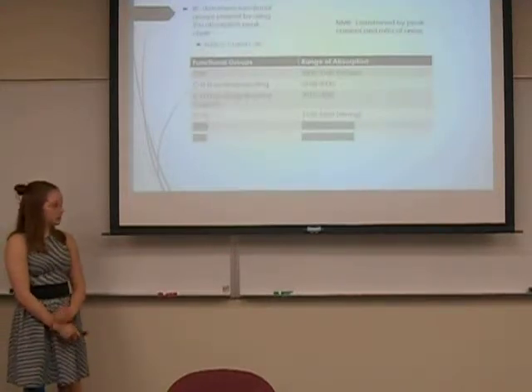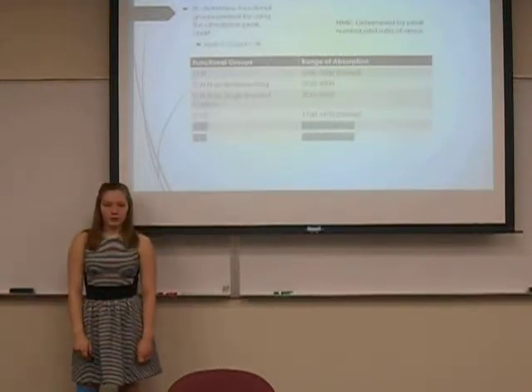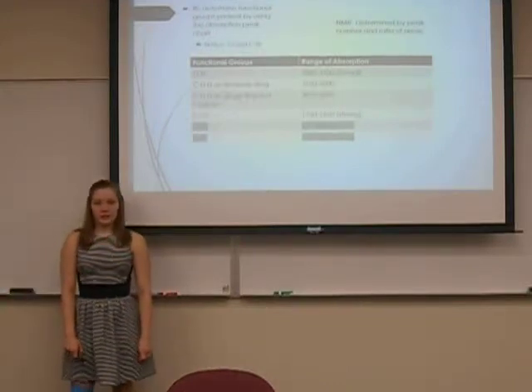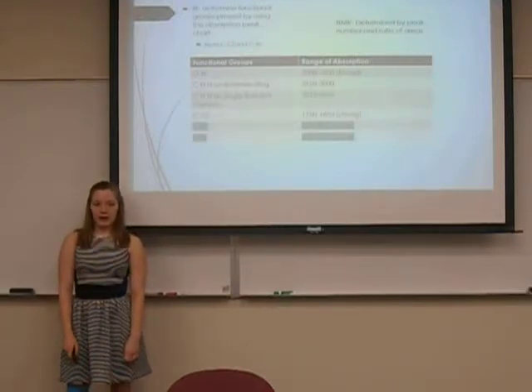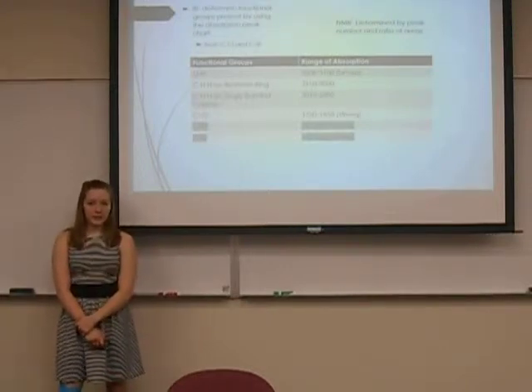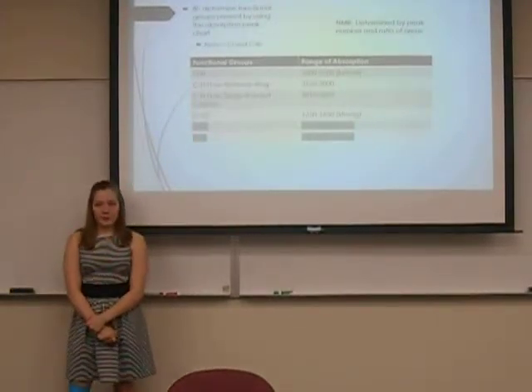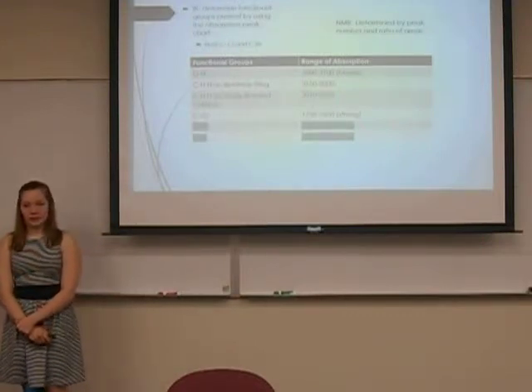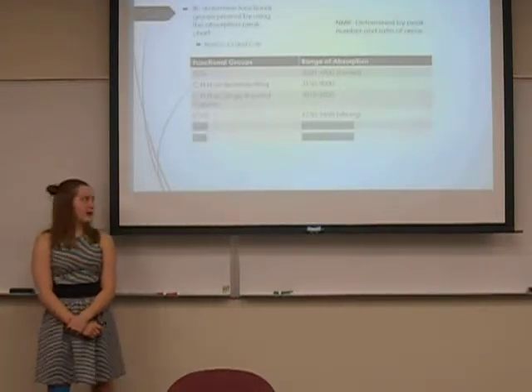Starting with the IR spectroscopy, we can see that we use this group with the absorbances to find each of the functional groups. Each has their own absorbance, and notice that some of them have broad or strong ranges that you have to note when looking at these. Using the NMR spectroscopy, we can find the peaks and the ratio of areas and be able to finally determine the one compound that it actually is. Note that when looking at the IR spectroscopy, I highlighted the CCl and CBr absorptions because for these, we often do not look at them when there's other functional groups present, but if there are no functional groups present, you can look at these to try and determine which compound it actually is.